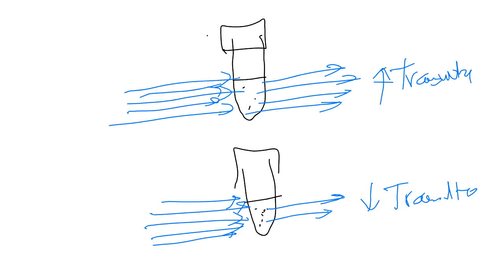Now this is the next thing. Instead of getting a value for transmittance, we're going to turn the coin and get a value for absorbance. In other words, instead of measuring how much light is transmitted, we're going to measure how much light is absorbed. Just for the sake of numbers, to give an example, not that these are the kinds of things we measure, we don't measure rays of light, but we have 5 rays of light here. 4 are transmitted, which means 1 was absorbed.